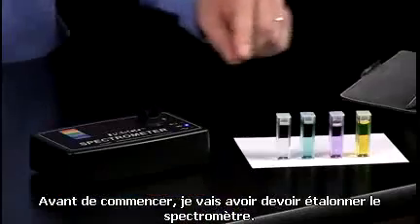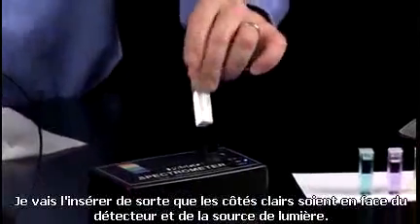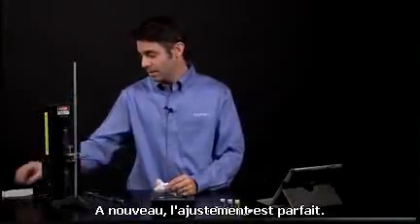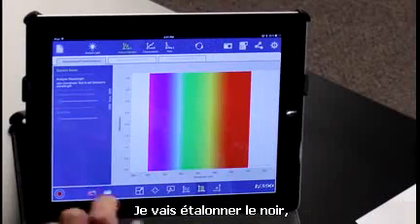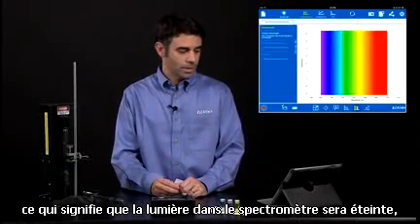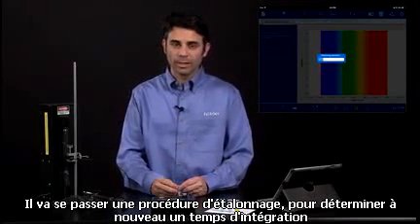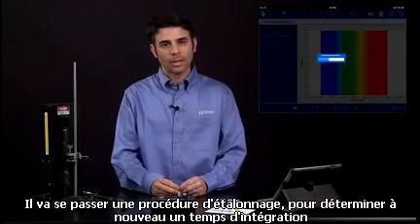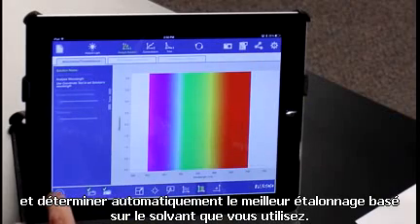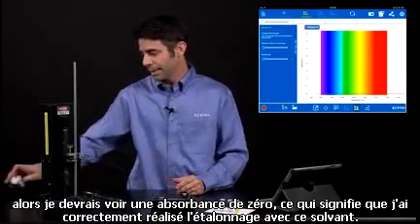Before I do anything, I'm going to need to blank the spectrometer. I'm going to take the cuvette containing my solvent and put it in so that the clear sides are facing the detector and the light source. I'm going to calibrate dark, meaning the light in the spectrometer will be turned off, then calibrate light, meaning the light is now turned on. It'll go through a calibration procedure, determining an integration time and setting the best calibration based on the solvent you have. If I hit Start right now, I should see an absorbance of zero, because I have successfully blanked this solvent.